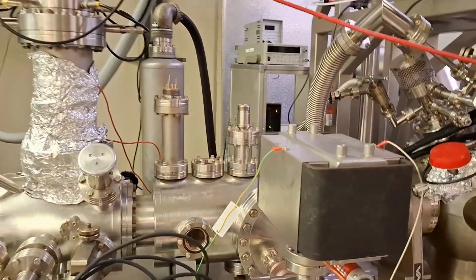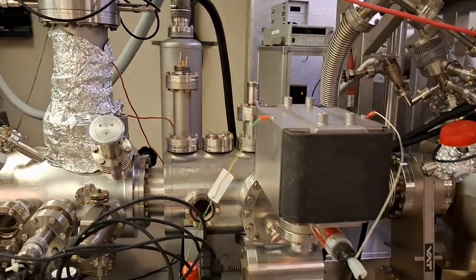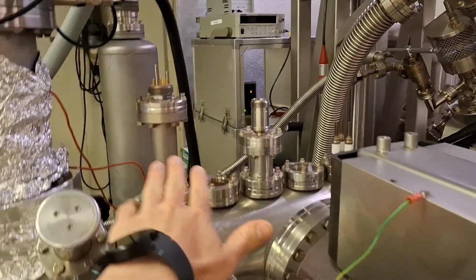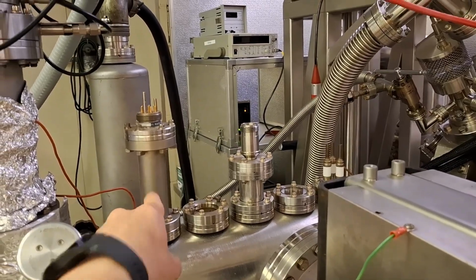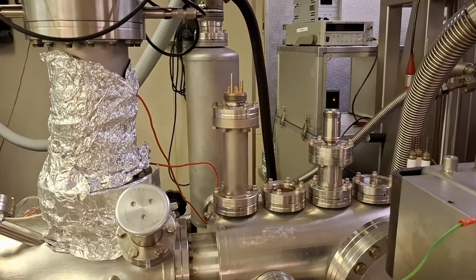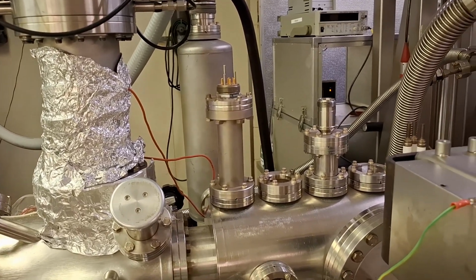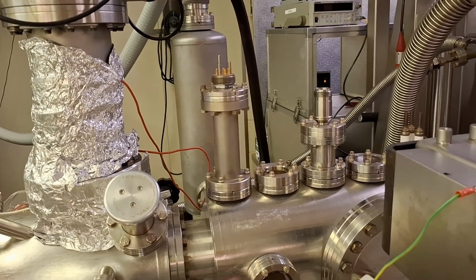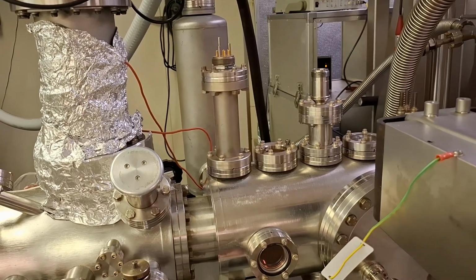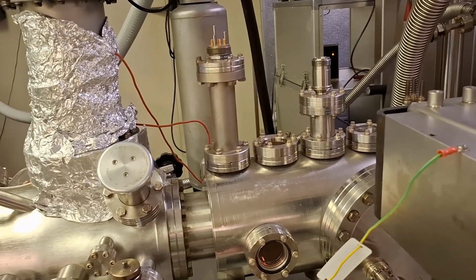If you look at the second chamber, this is the ion pump, and you can see the sources. These are the sources. And for instance, this is a lithium source. It is an alkali metal dispenser, and these sources are commonly used in surface science systems to deposit a small amount of lithium onto a single crystal under ultra-high vacuum conditions.